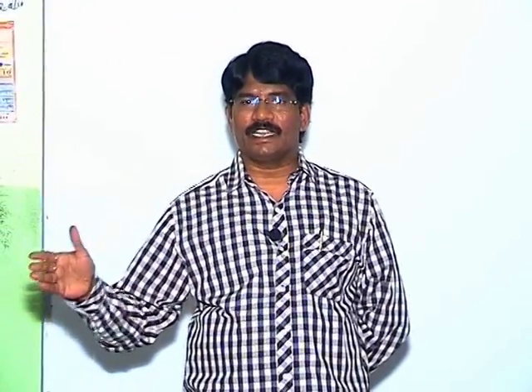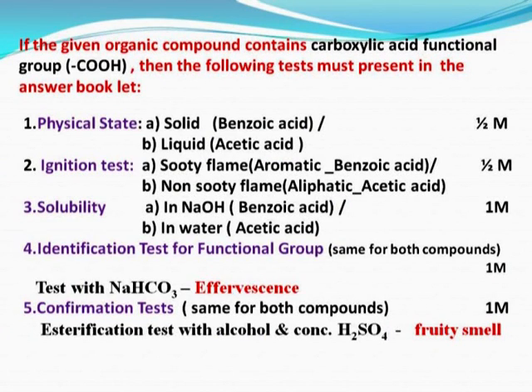Then pour the contents into water. A strong fruity odor is observed. Then the ester is formed, and the carboxylic acid functional group is confirmed. Suppose no change is observed with the action of sodium bicarbonate, then the carboxylic acid functional group is absent.